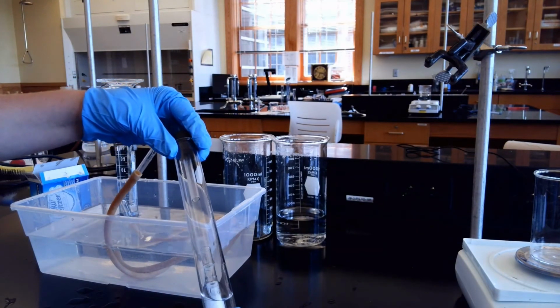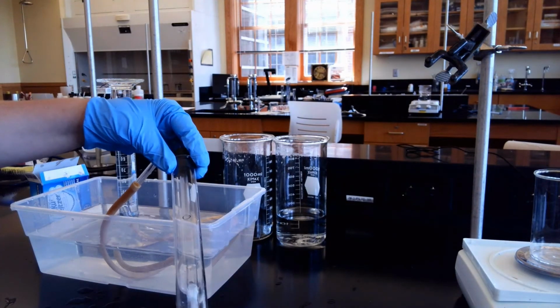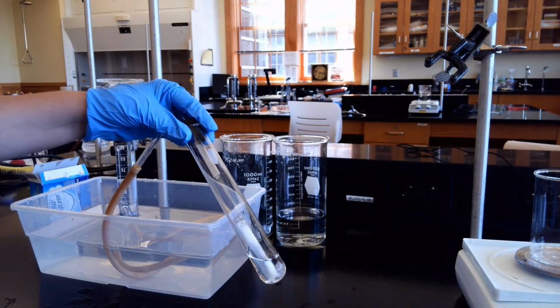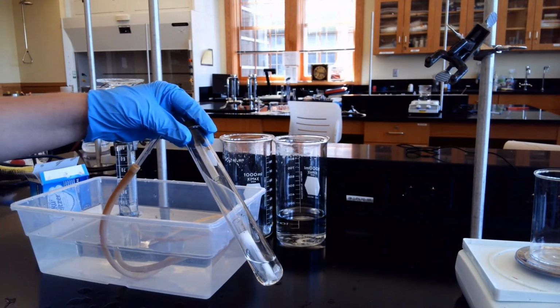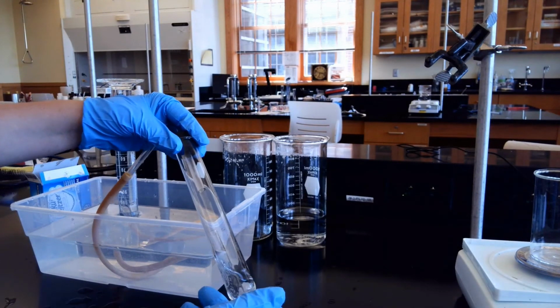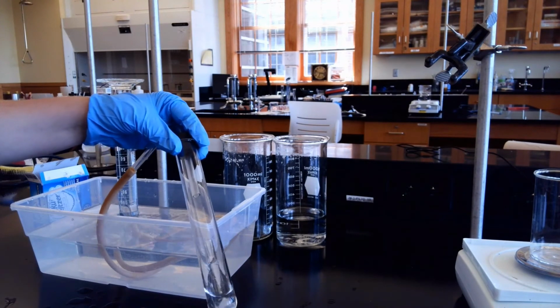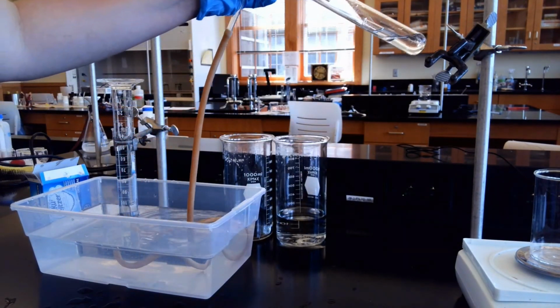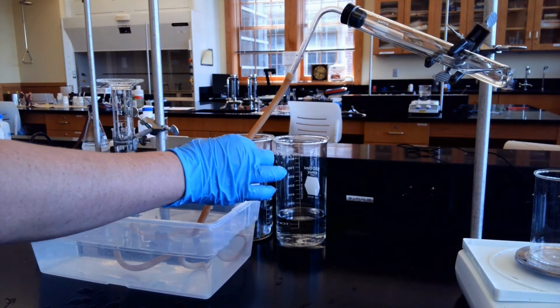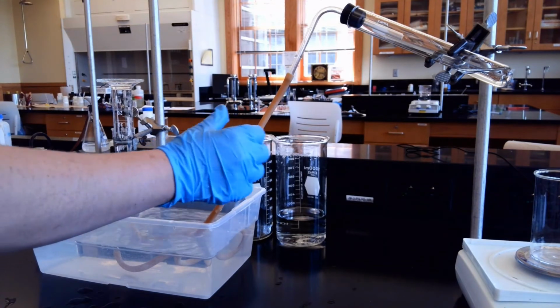Put some more in. And just a little bit more in. Looks like we've reacted everything. So we're just going to give it a second to make sure that there's any other CO2 that might be in the line. Can go through and in. And I think we're good.